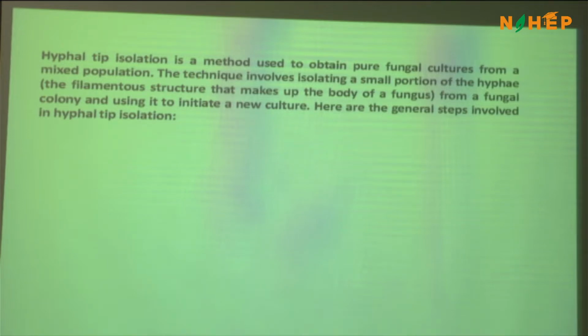Bacteria, from that perspective, are quite easy and comfortable because they are single cell organisms and they develop a single colony. Single colonies are progenies of the same genetic makeup. So there is no difference in the progenies if you are picking the same colony. But fungi is quite different, because isolating a fungus in the genetically pure form is always a challenge.